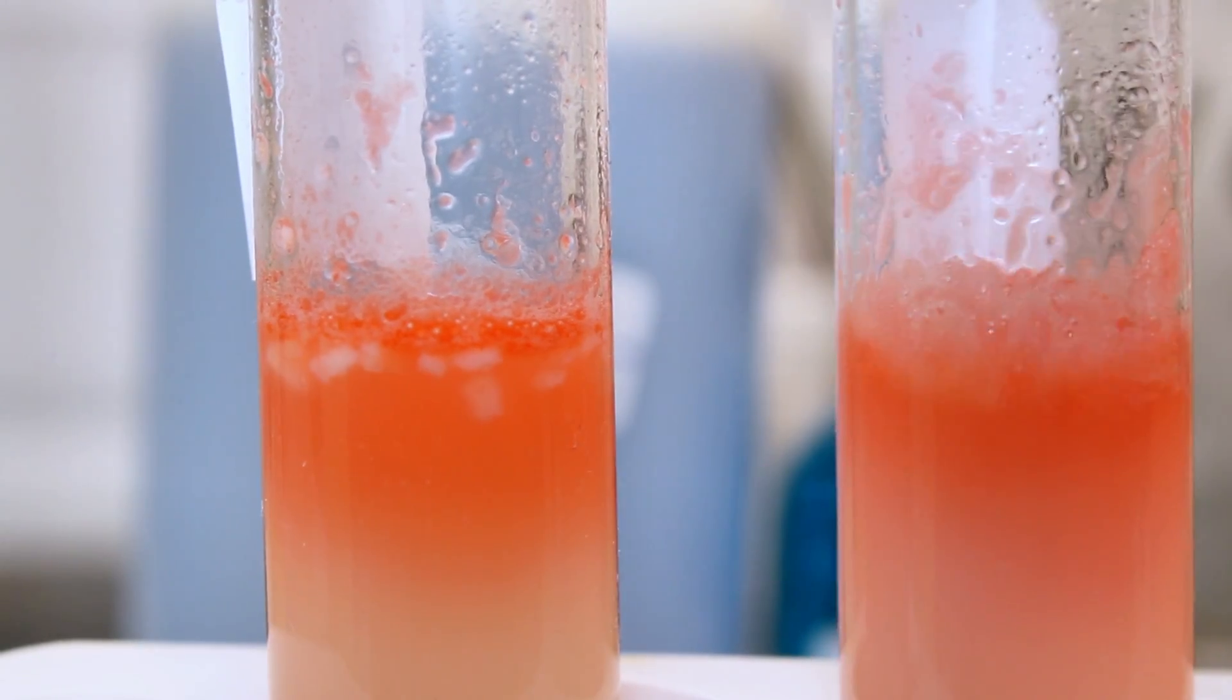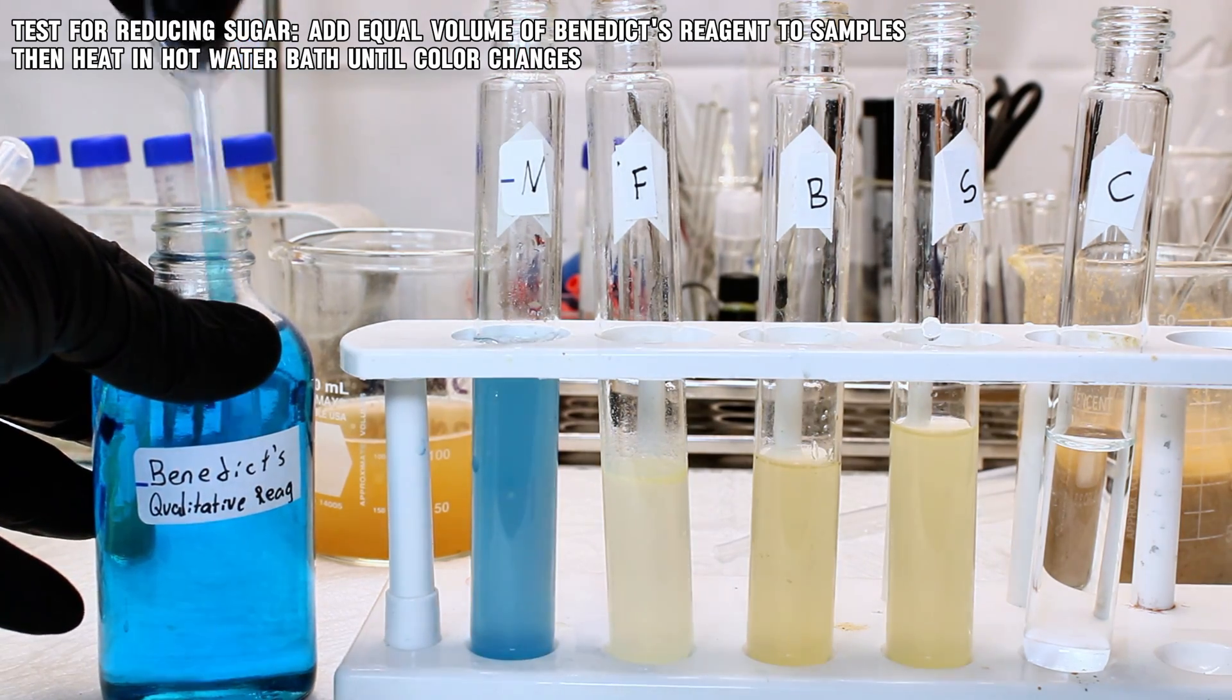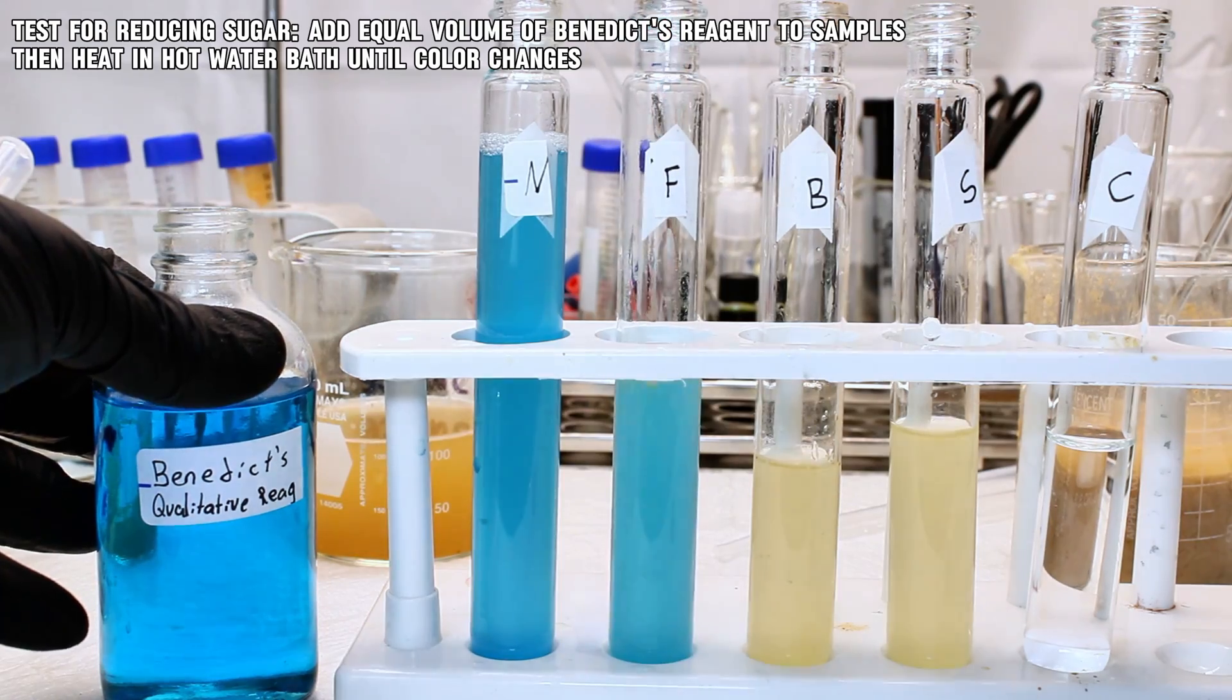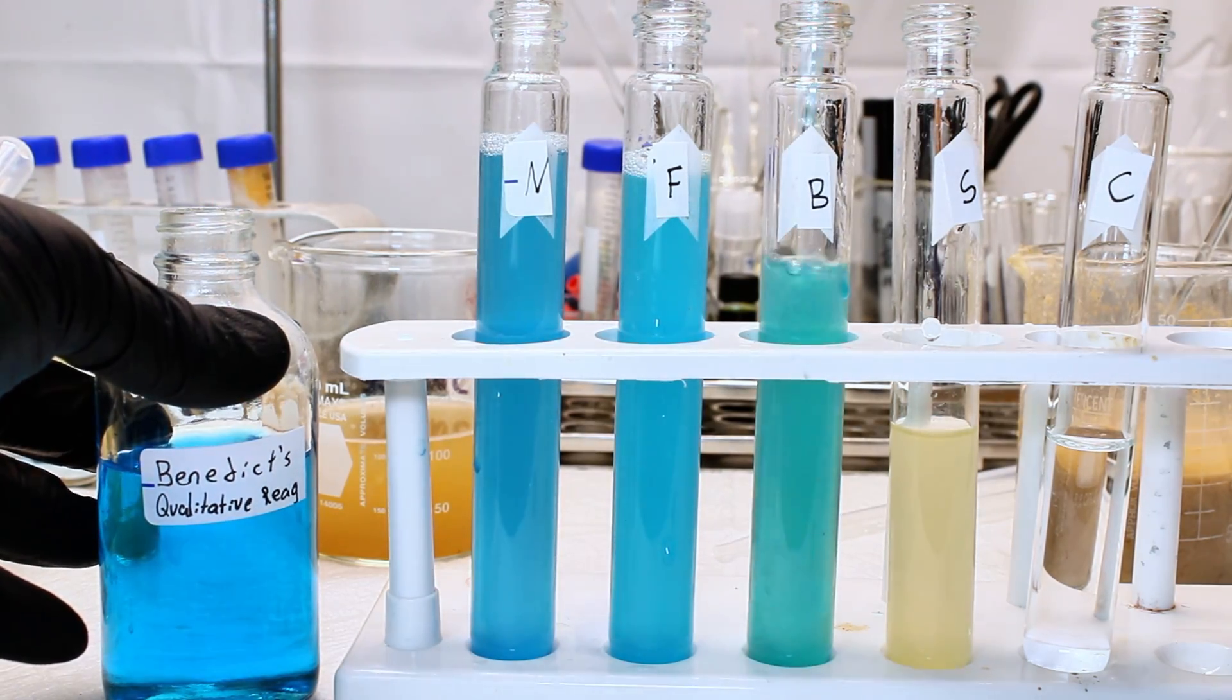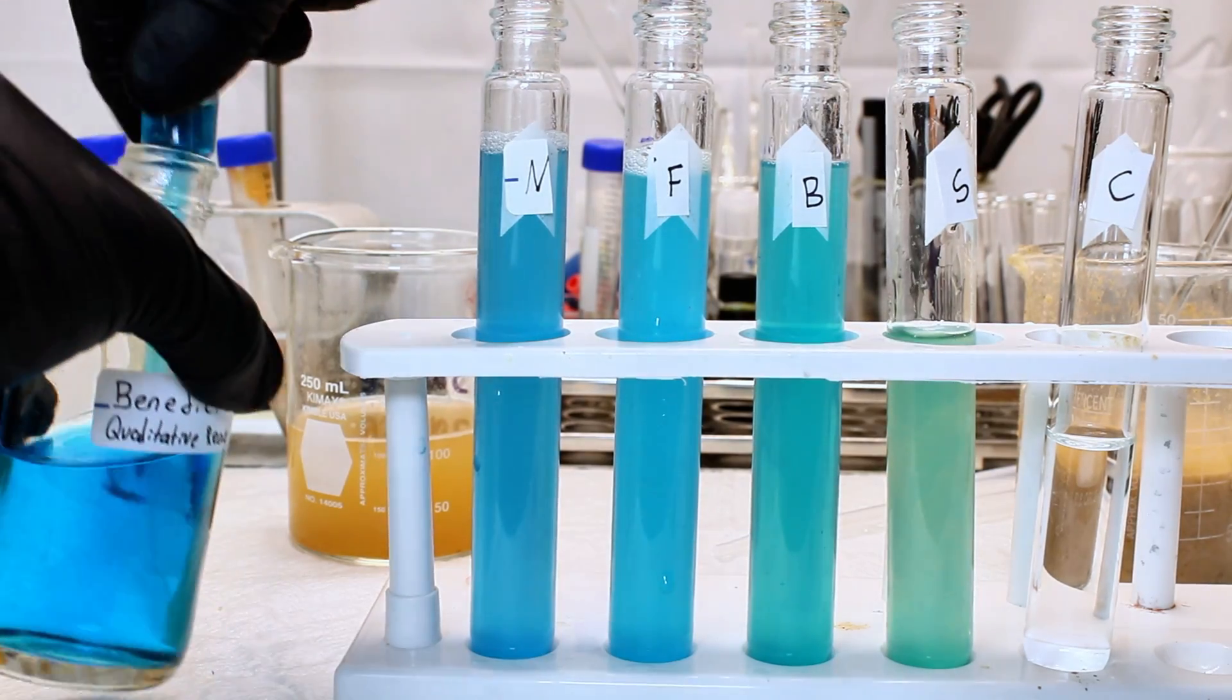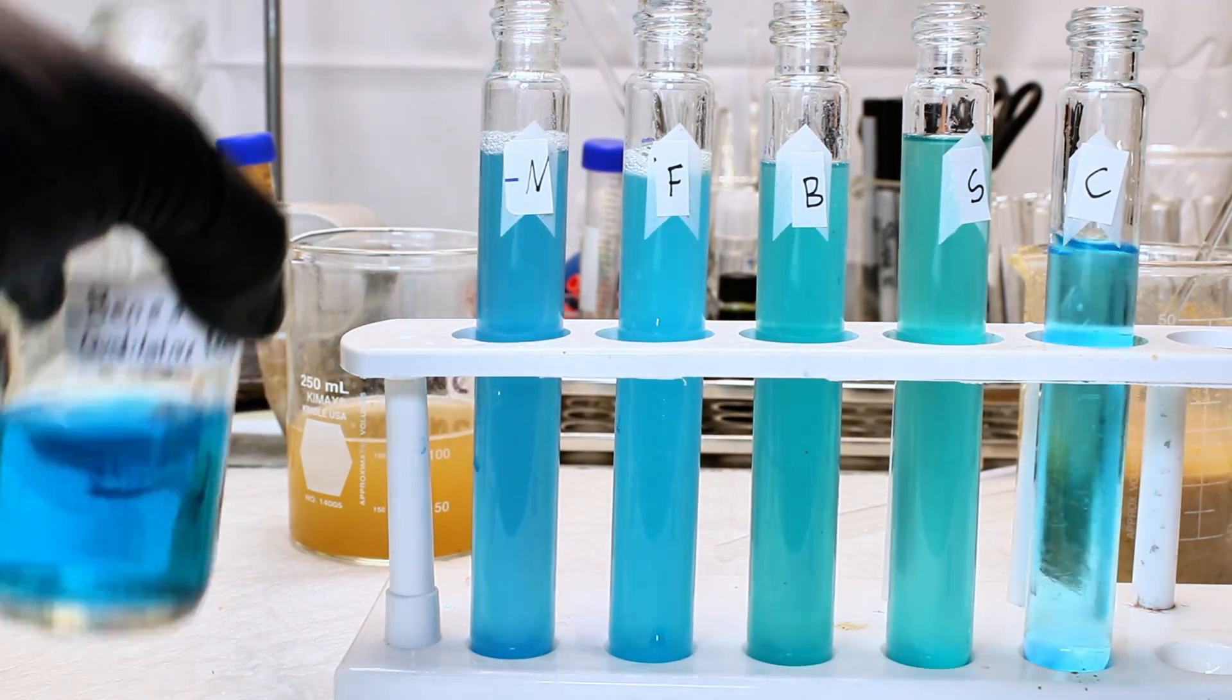Now moving on to my final test, it was time to test for sugar. And this is done using Benedict's reagent and works much in the same way as the Biuret reagent, except that the samples here have to be heated to get a result. To that end, I added Benedict's reagent to all my samples and then put them in a beaker of water that I heated on my hot plate until eventually I got a color change.